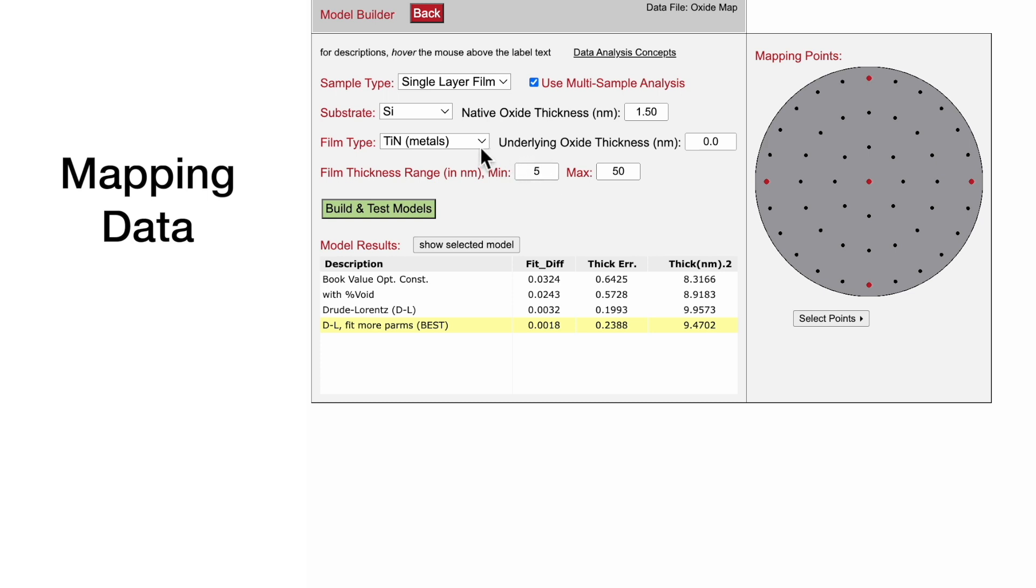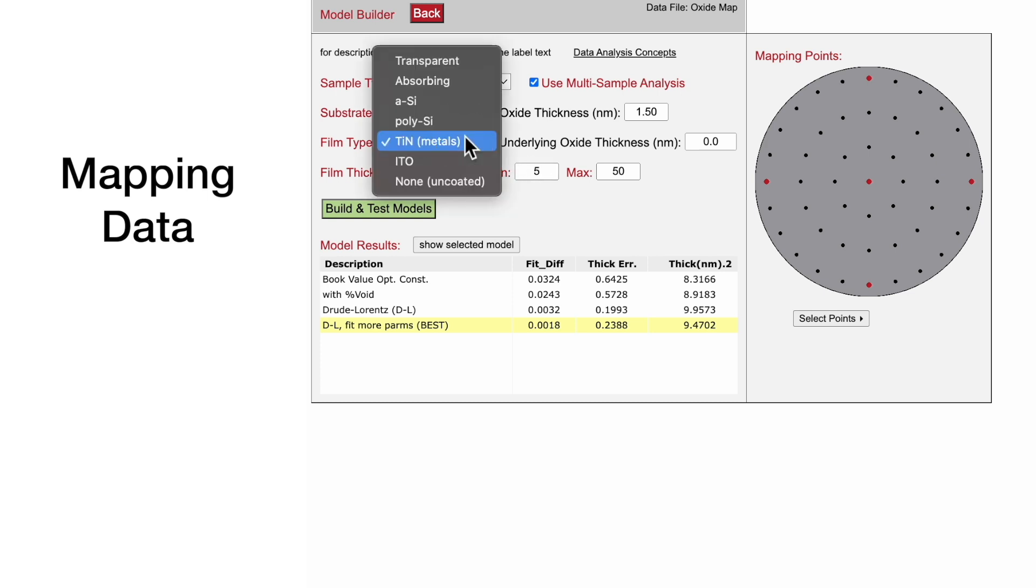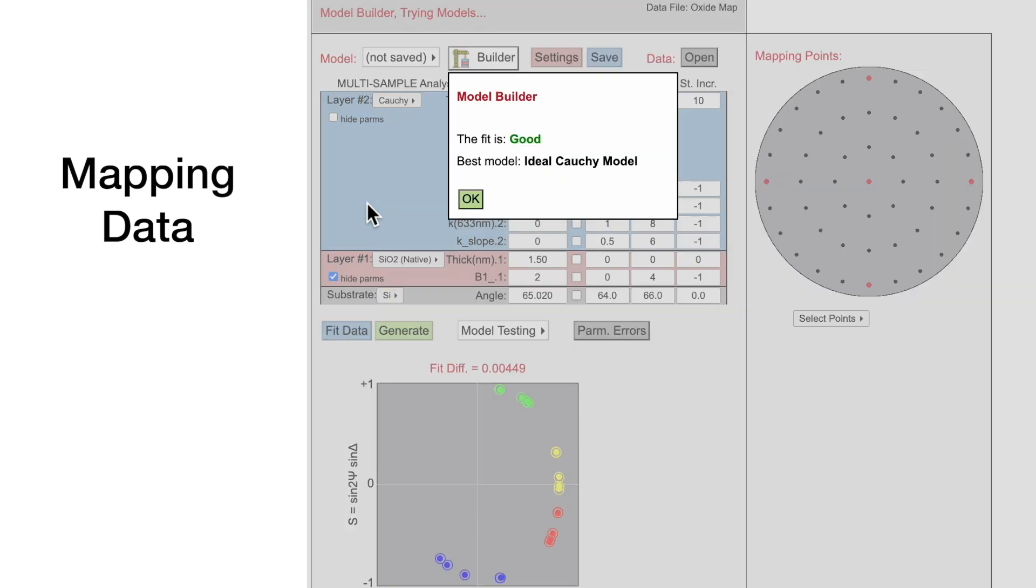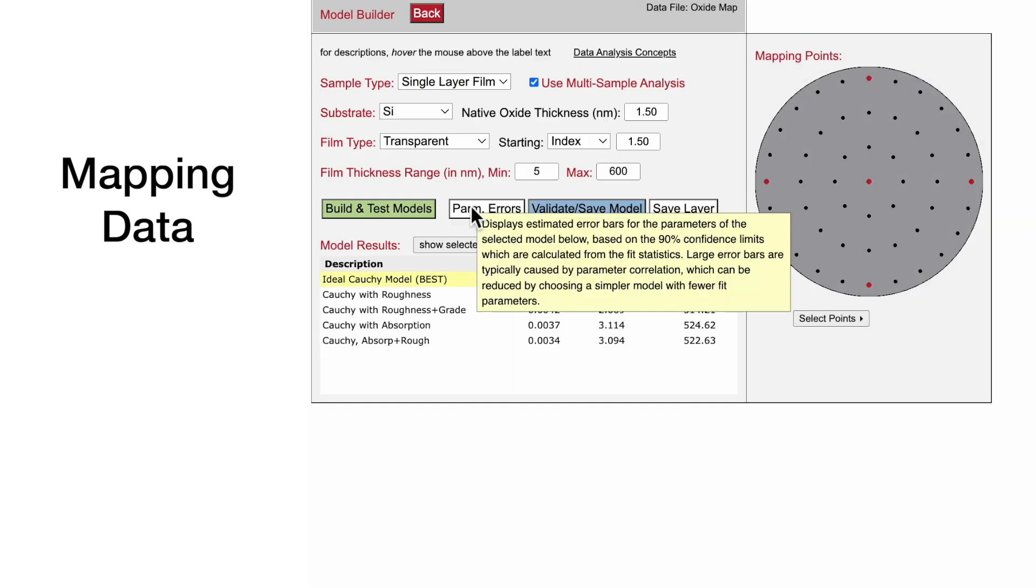We will select a transparent film type with a starting index of 1.5 and a maximum film thickness of 600 nanometers. Then Build and Test, and an ideal Cauchy model provides a good fit to the data.